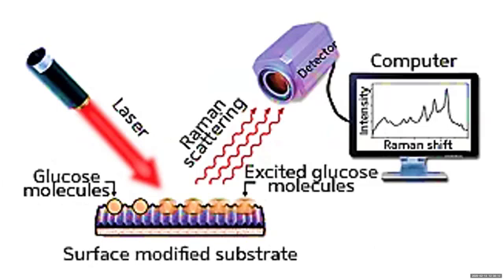But the Raman signal is very weak. So we need to enhance this signal, for which I design nanostructures, which give general signal enhancement. So now we are also integrating nanotechnology in our research.